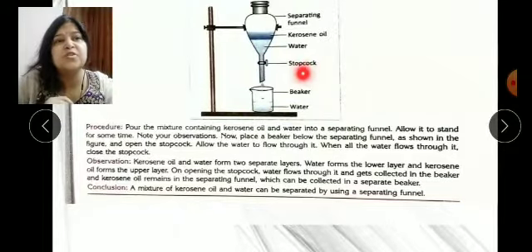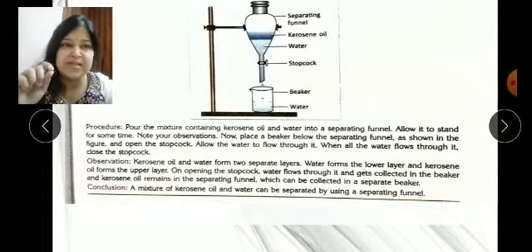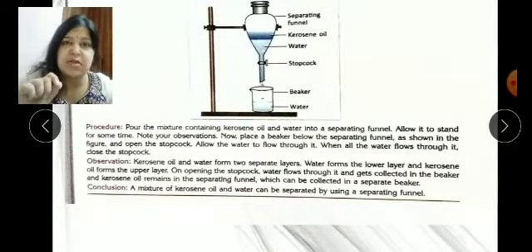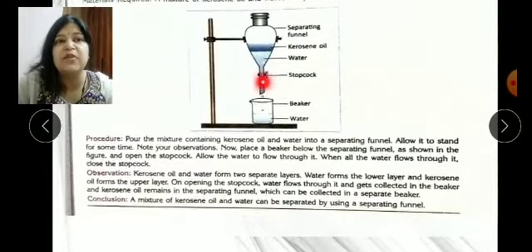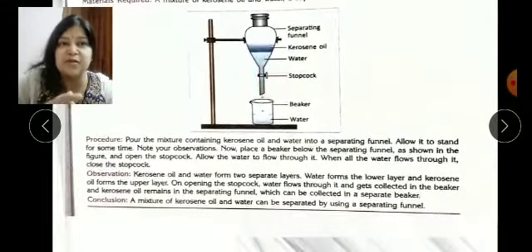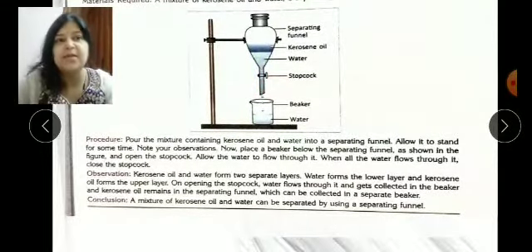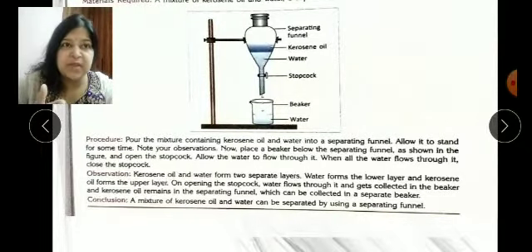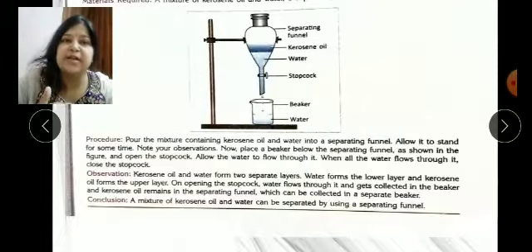We should open this stopcock, which is a knob-like part of the separating funnel. When you open it, slowly water will come out in the form of water droplets as you can see here, and we can collect it in an empty beaker.